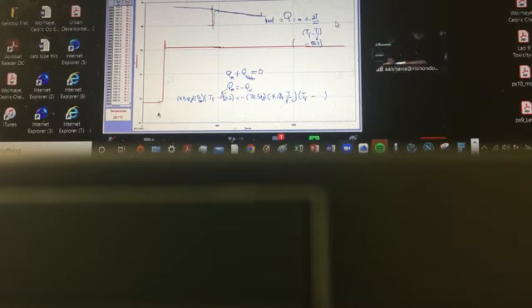I guess that is the measurement. Let's just get an idea of what's going on. So that temperature does not go down, so we can stop the process, okay, if you want. So you're gonna go back and just stop that process, which is fine. The process did not go beyond that number. So it resists going down. All right, so here's the cursor at the initial temperature, and can you see those values? Can you look up that window, the X and Y, and locate that initial value of that temperature? Can you see that Y value of the cursor?